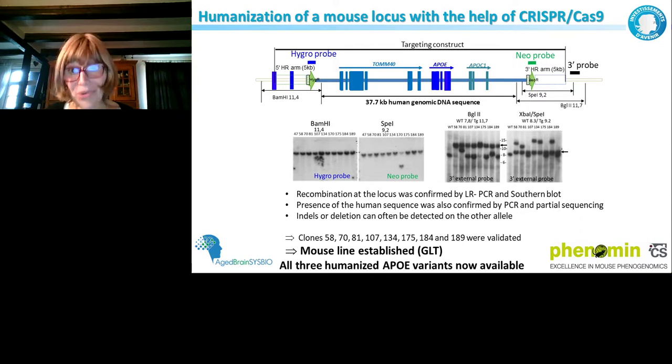You could see that in most of the cases, we had only one band, which is nice. I want to show you here a plot where, with a little arrow, you can see the expected band, but also what is sometimes disturbing when you work with CRISPR on ES cells: you can also see that the wild-type allele can move, because you can delete completely the wild-type allele, and you can generate the deletion of the whole part on the other allele, even if the targeted allele is correct. But when we see the correct targeted allele, we don't care about the wild-type allele. And that's very important also when you analyze ES cell clones that are issued from CRISPR Cas9 electroporation.